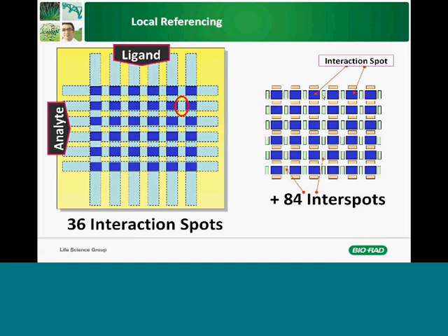All data is being collected all the time. So once the data is collected and you go to analyze it, you have this data. You don't need to choose a priori. All the data is available, and you can analyze your data with several options and decide for yourself which is best.